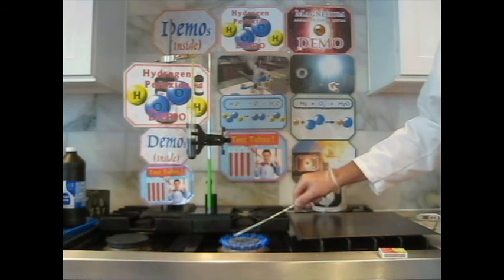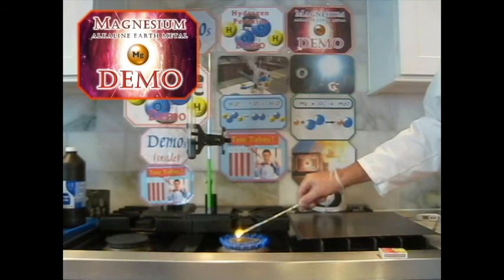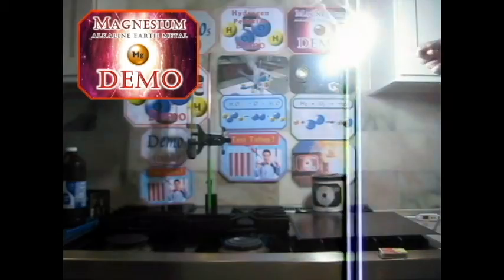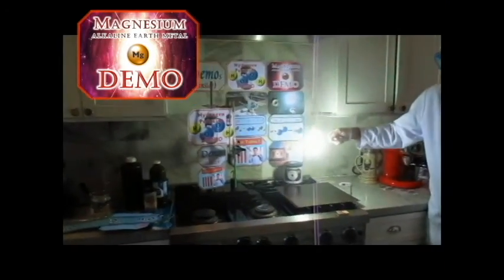Okay, so this one is a little harder to get started on a stovetop than it is with a Bunsen burner. There we go. So now I got 2. It's like a binary star. Is that as bright as the sun? Look at all these shadows. See the shadows forming? Look at all these shadows forming. That's what they use in flares. This is a really good one.